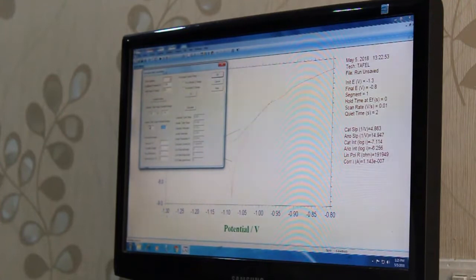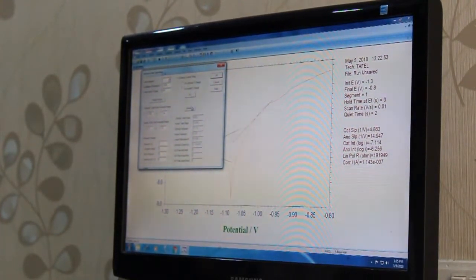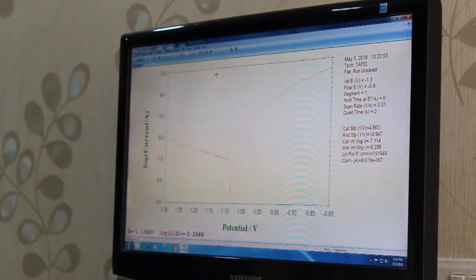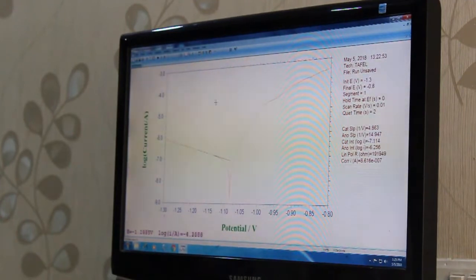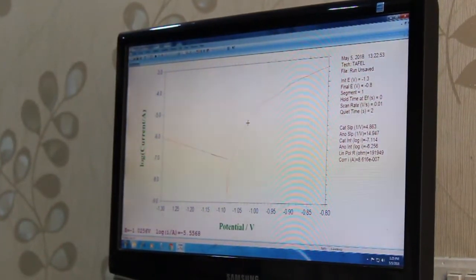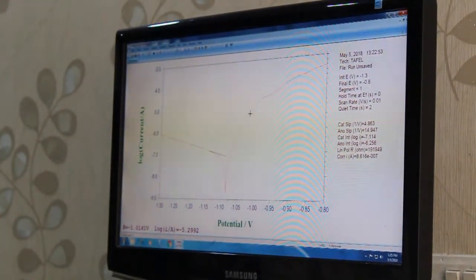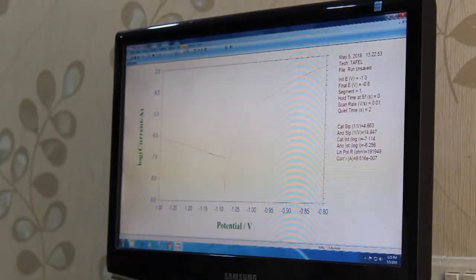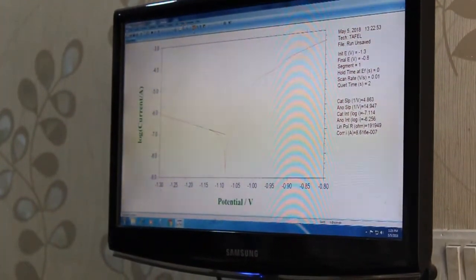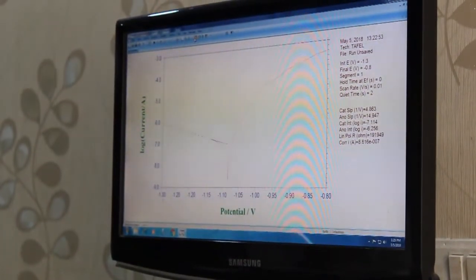This would be minus 1.0. Let us say that calculate. Okay. Did it do? Minus 1.01. 1.0. Why is it not doing that job? What mistake am I making? Can anybody improve that now? Which potential do I have to give? Can anybody make a suggestion?